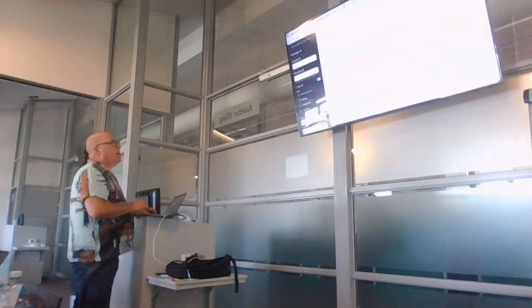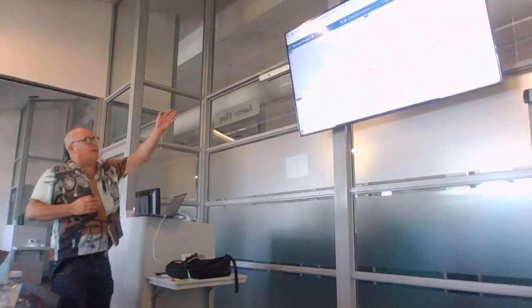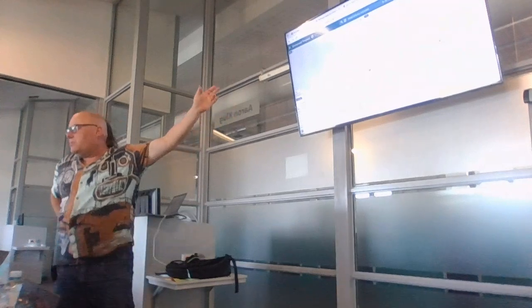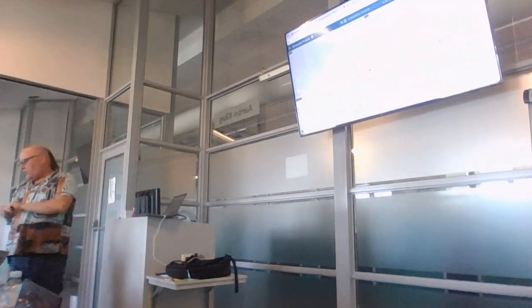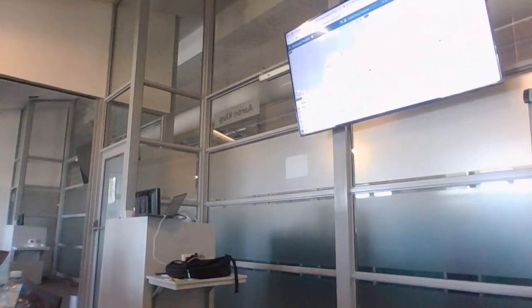Okay, so have other people managed to get this picture on their screens? Okay, now let me look at all the people who've not managed to get that picture with the broken metadata and things like that. I want to show you one more thing, but let's see what your metadata looks like.